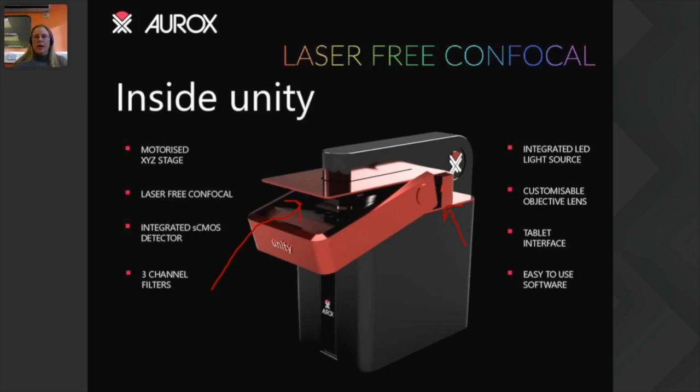The sample holders are our specific ones. They're designed to sit in our XY stage, and eventually there will be some identification so that when you put in your sample holder, it will automatically recognize which sample holder you have in place.